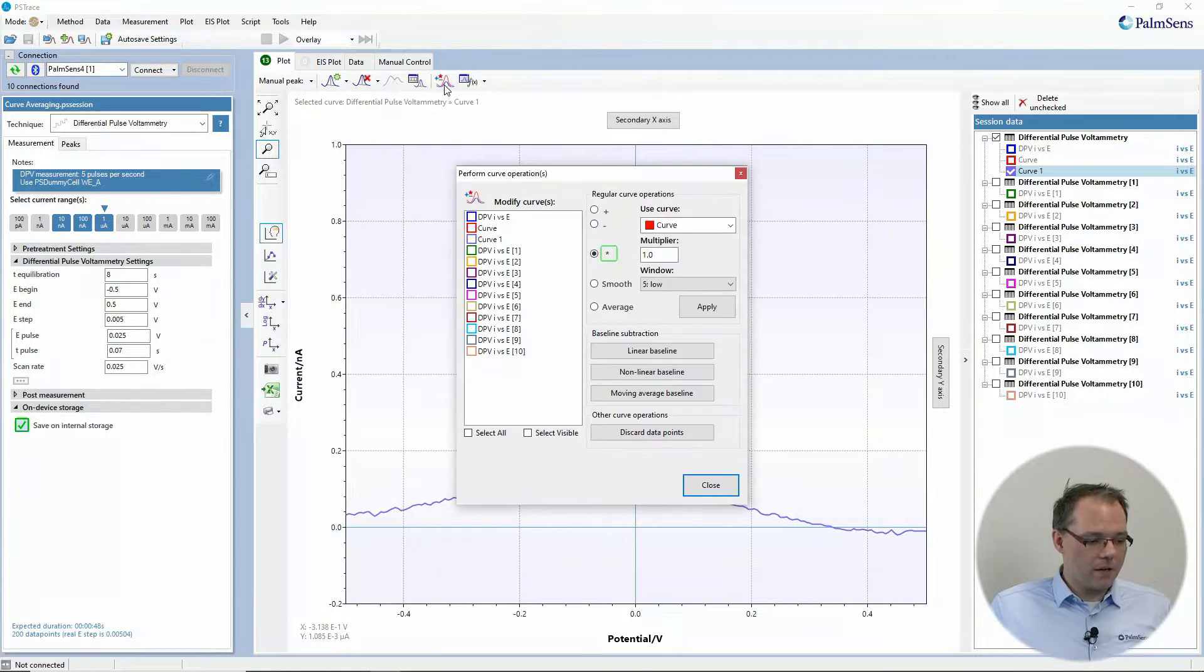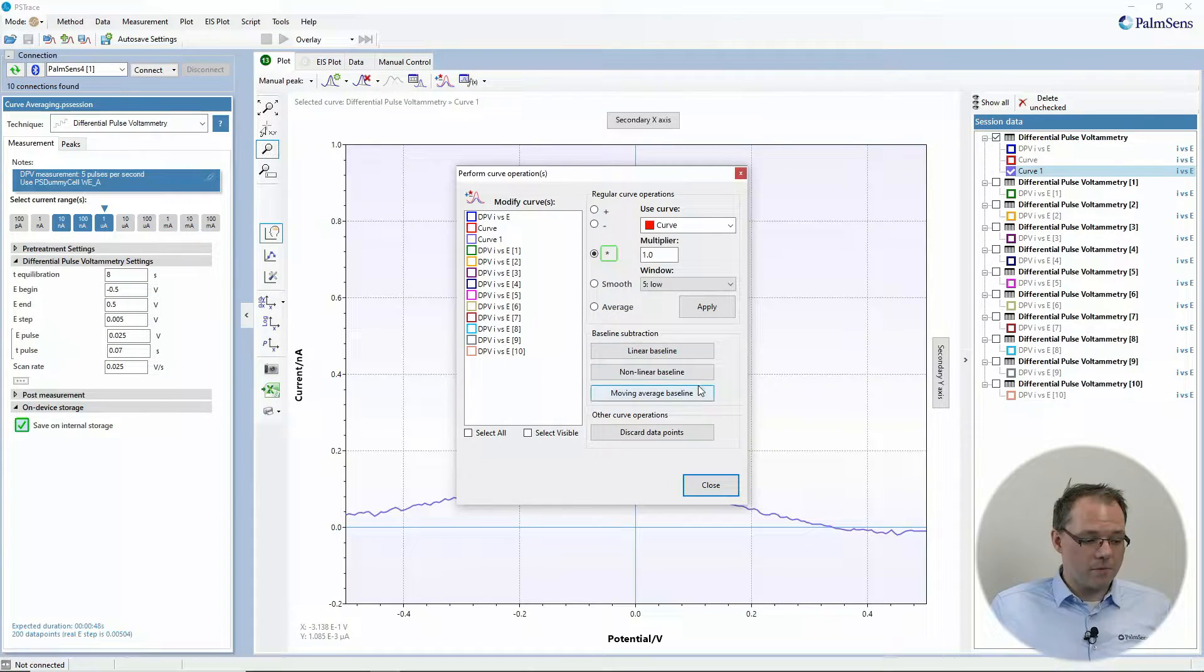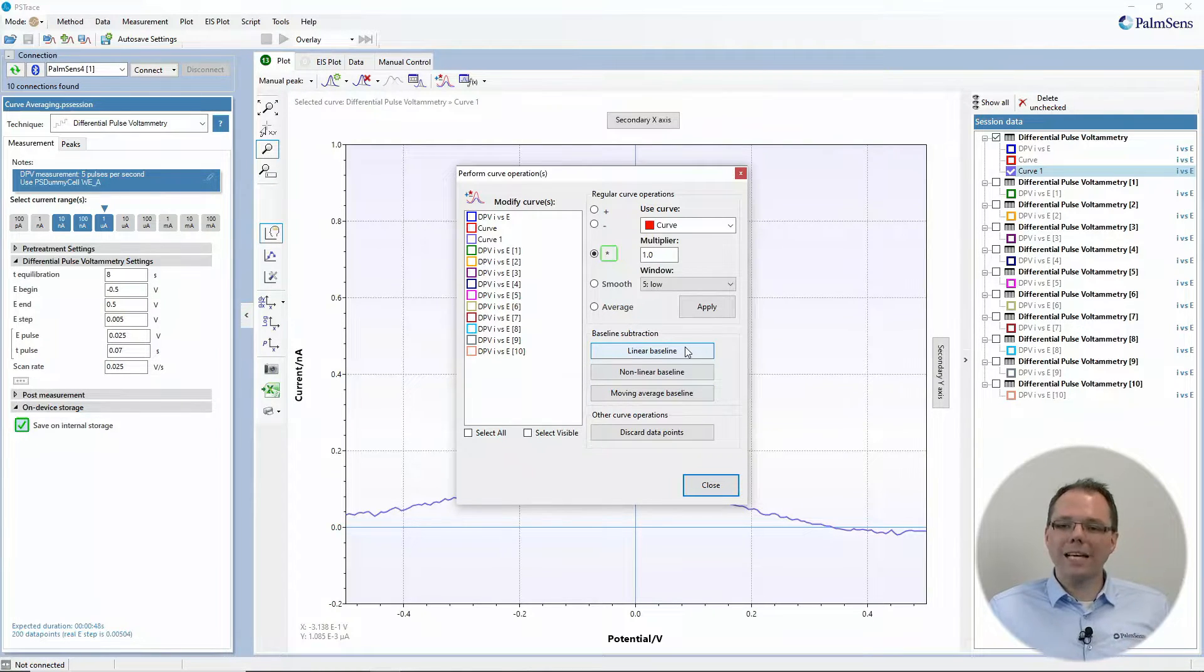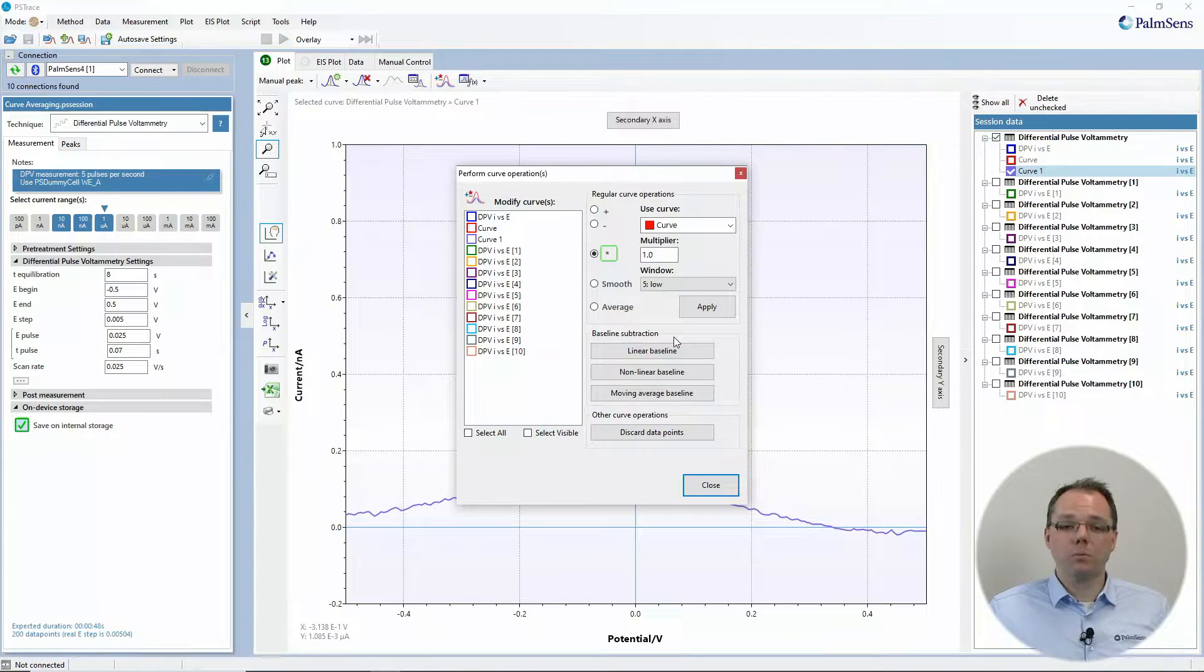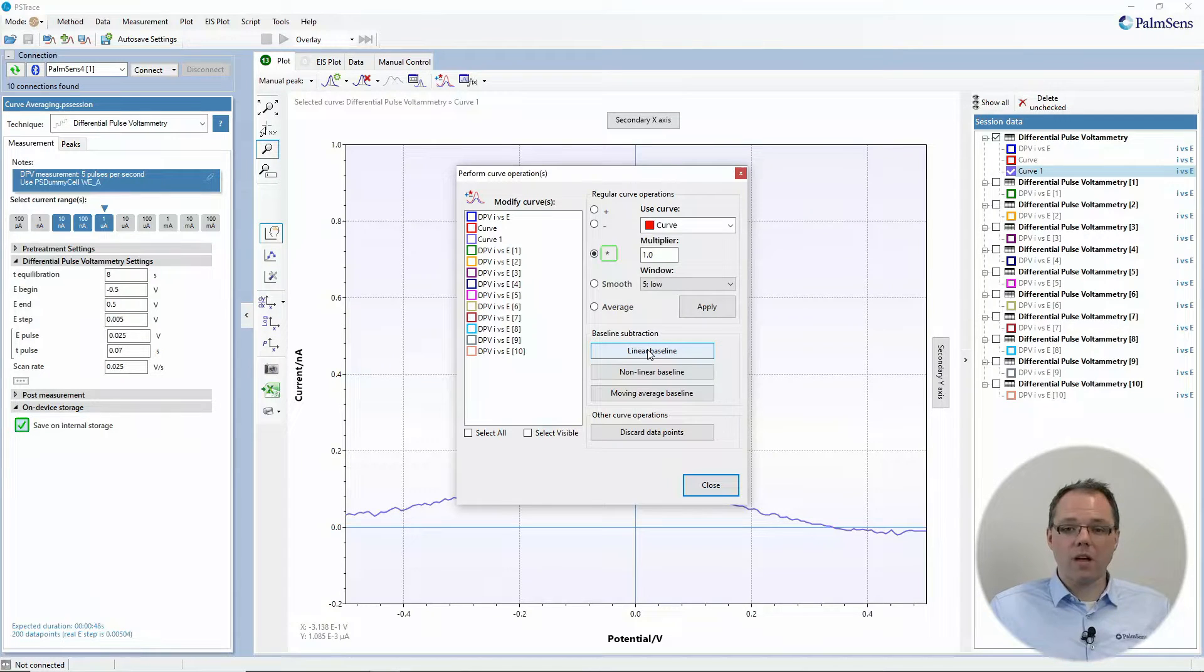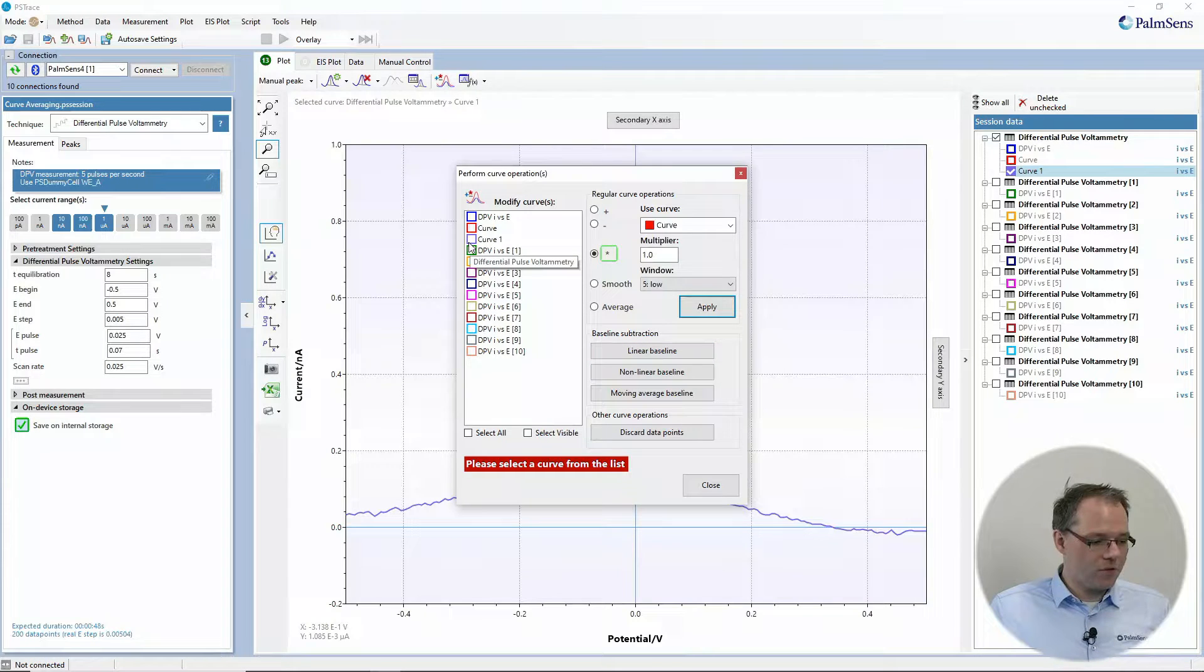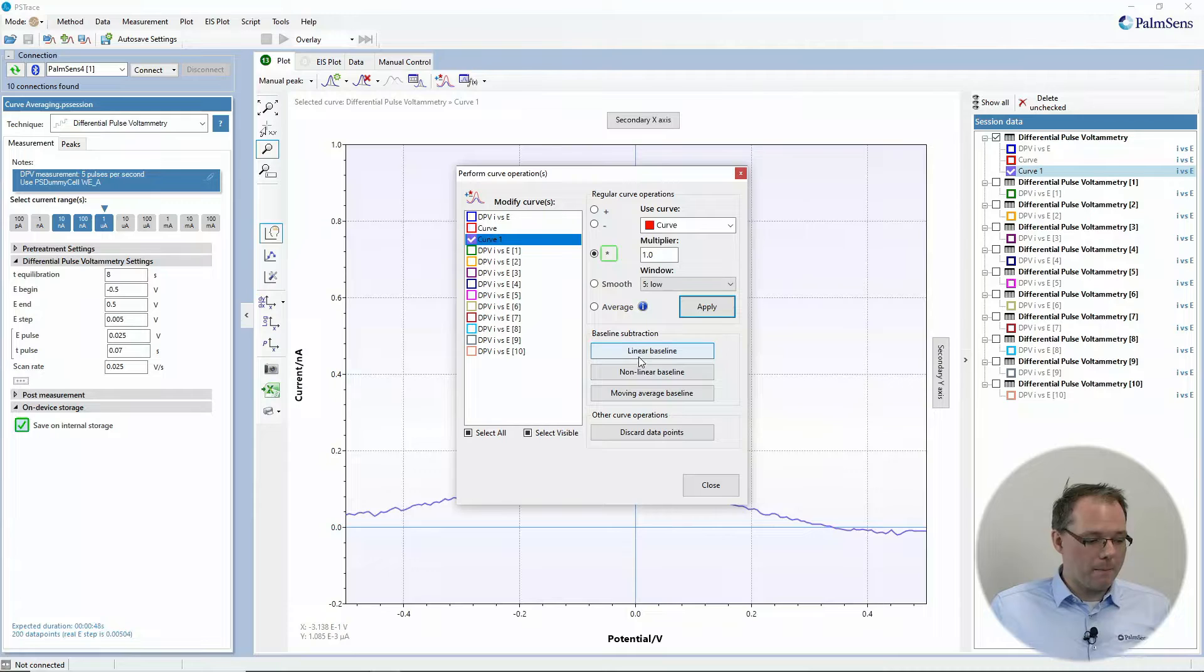This is also offered by the curve operations window. We have multiple baseline subtraction offers. But this is now for you creating a baseline. This is not if you have made a measurement that is supposed to be your baseline. So for example, you can just make a linear baseline. This is if you have like already a rather nice flat curve.